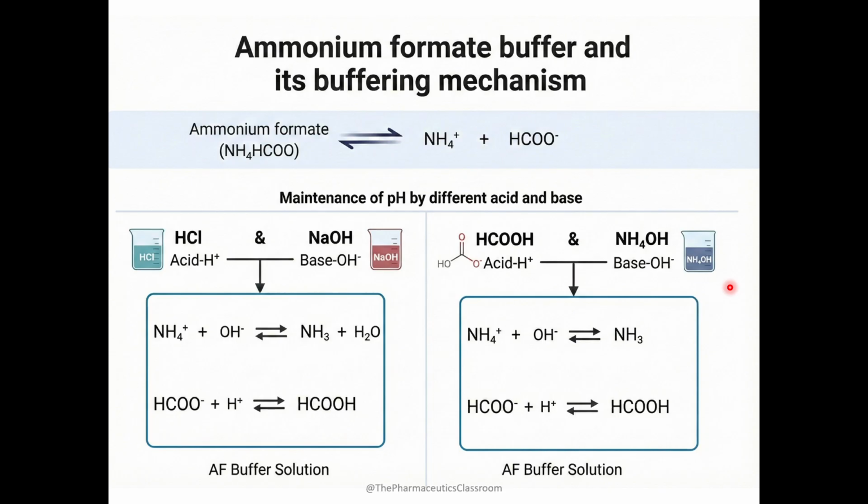If we take ammonium formate alone, once we dissolve ammonium formate in water, it will dissociate into ammonium and formate ion. So in our solution we have two things, this ammonium and this formate.